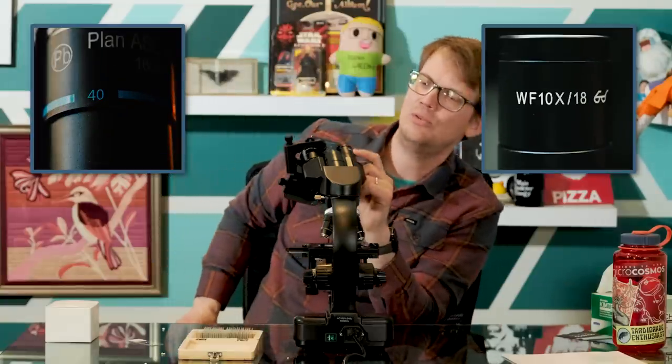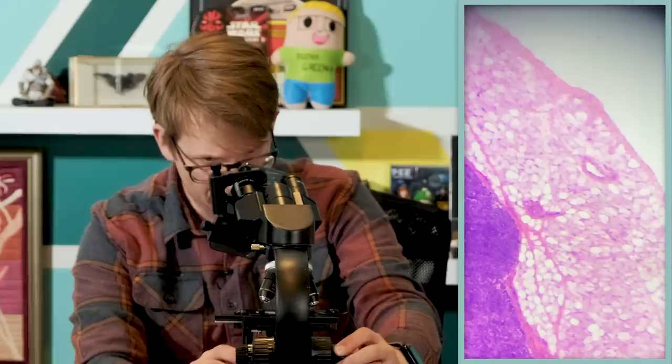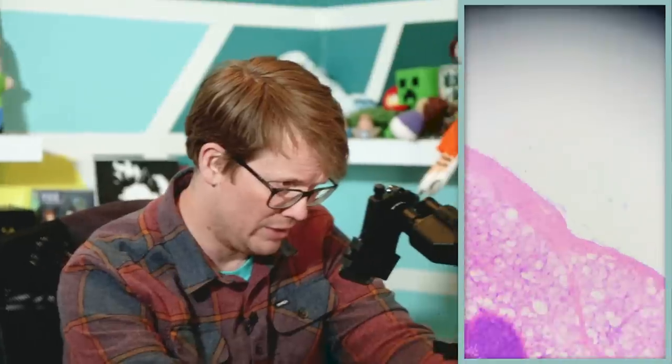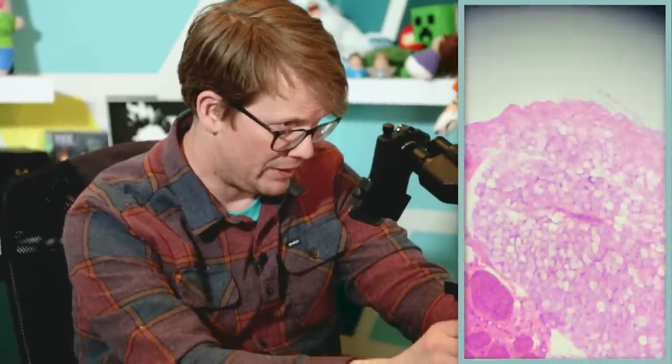The thing to note is that when we say 40X or 20X or 60X for the objectives, that's going to be multiplied by 10, because each one of these eyepieces is also a 10X. So a 40X objective is actually 400 times magnification — 40 times the 10 of the eyepieces. There's a fair bit to know about microscopy, but as soon as you start to do it, you have all of this incentive to learn, and then suddenly you wake up one day and you know the difference between a dinoflagellate and a rotifer — which, if you watch this show, you're probably already there.